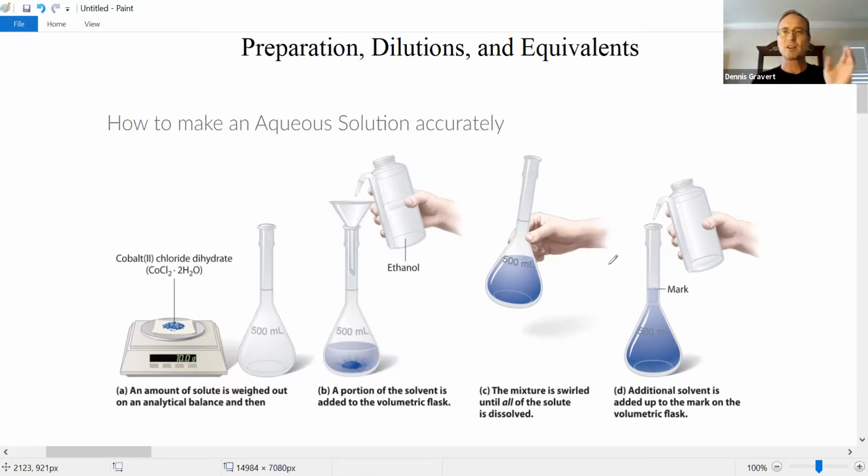So water kind of sticks to glass. So the level of water isn't perfectly flat, it's kind of curved as the edges of the water stick to the flask, the glass. And what you want to do is look at the bottom, the lowest point of the surface. It's called the meniscus. And you want to line that meniscus, the bottom of the surface, right on that mark.